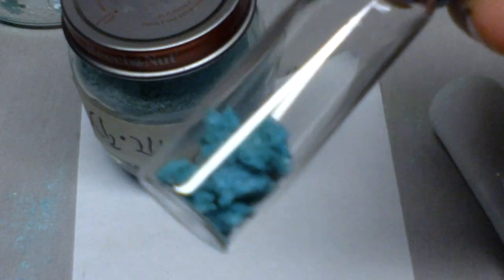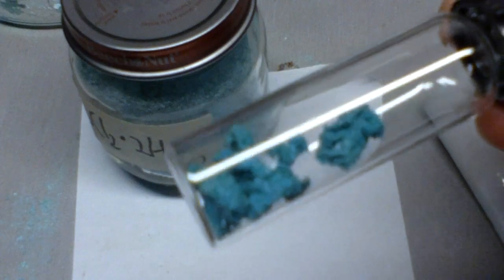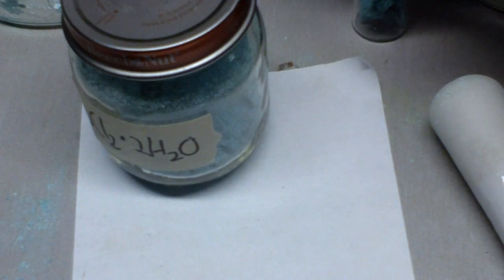As you can see, it is a whitish blue-green crystal, and that is the final amount I got using the amount of copper I used. I also saved a few crystals of it for growing a chemical garden.